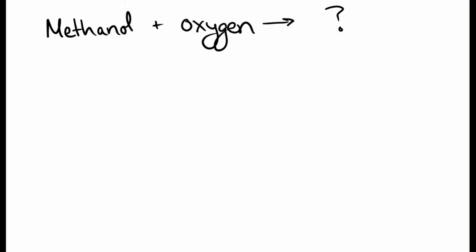Okay, did you catch that again in slow motion? Oh, I thought that was pretty cool. Pretty neat of me to be able to do that.